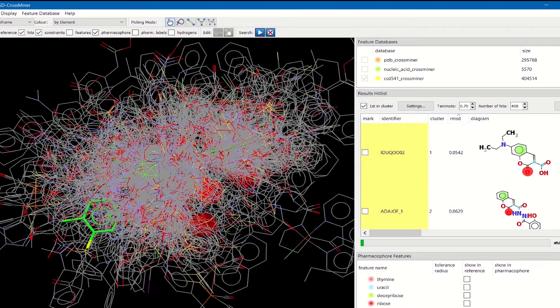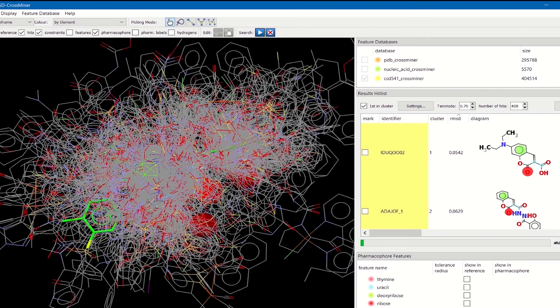The RMSD — the root mean square deviation of the overlay — is also represented. This gives information about how well the hit overlays to the pharmacophore query. The 2D diagram of the matching hit is also displayed, highlighting the substructure that is matching the pharmacophore point.